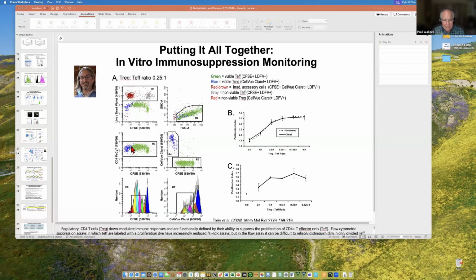I honestly think what's going on is that these guys are proliferating away. They're having a great time, and they're producing lots of cytokines. IL-2 would be the one that I would think of, but probably IL-15, IL-7, and a variety of other ones. That's having a bystander effect on the Tregs. That's what I think is going on. But it is clear that the more effector cells we had to the fewer Tregs, the more proliferation we saw in that population. We expected that these cells would just be quiescent and wouldn't do much, but it turned out that there was some proliferation. Hope that answers the question.